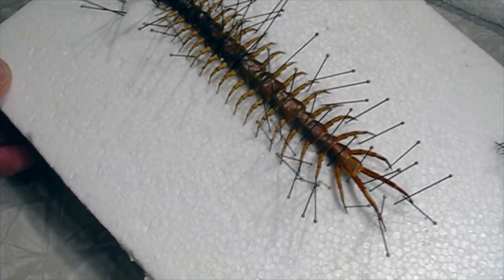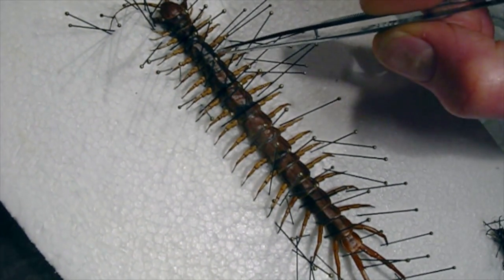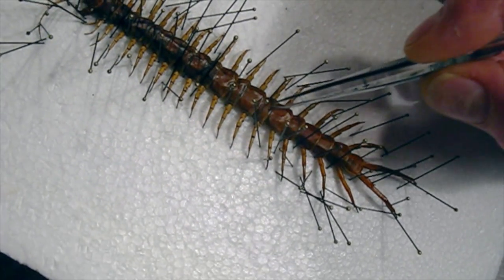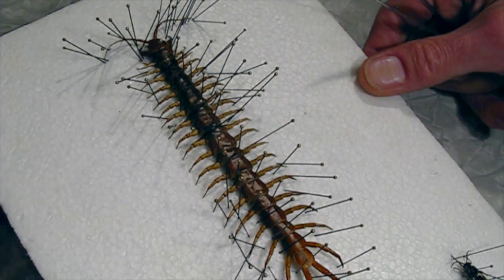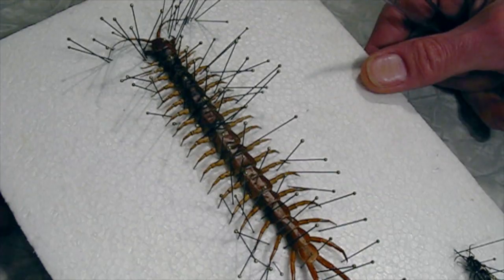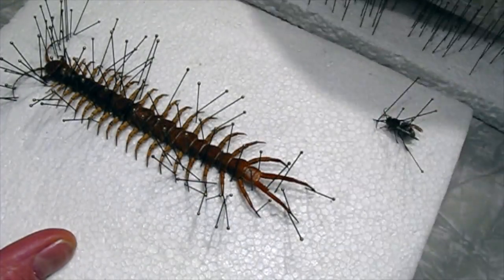It's been a couple of weeks and the specimen's dried. There's a little bit of wrinkling, but other than that, it really dried pretty well. We could have stuffed it, but I don't think that would have really made much difference. I think it's about as good as we could expect. So I'm going to pull the pins now.